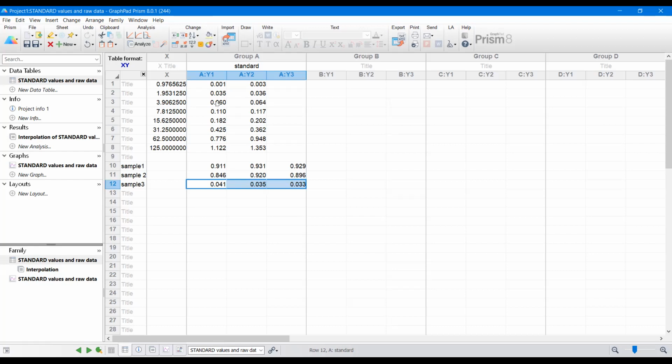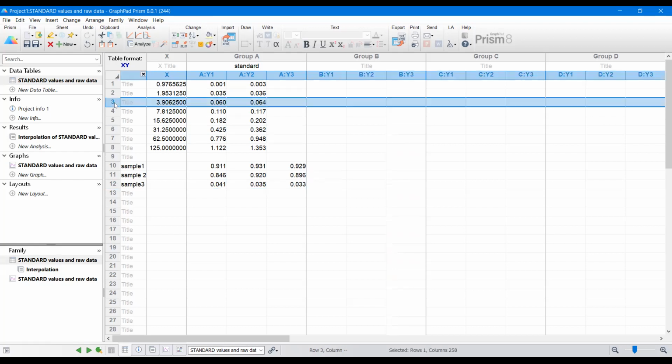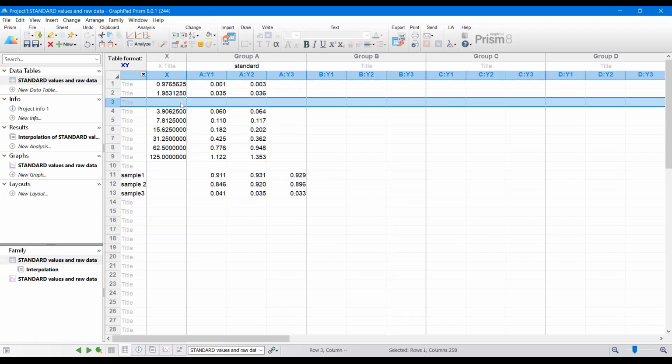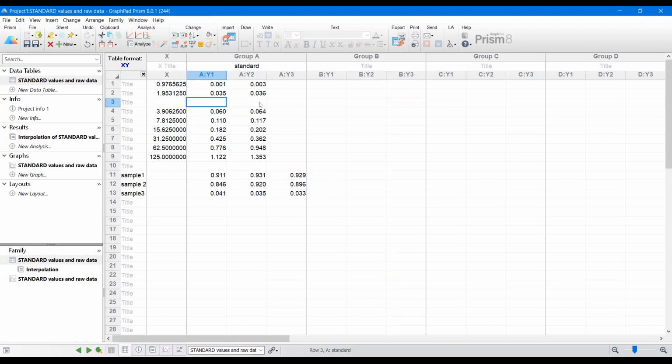But I'm pretty sure that if you put, for example, here another insert, for example 0.040, but please also consider that this is not the way that you should do it. I'm just trying to show you what happens if you give a value for that one.